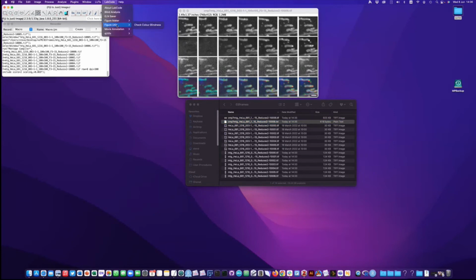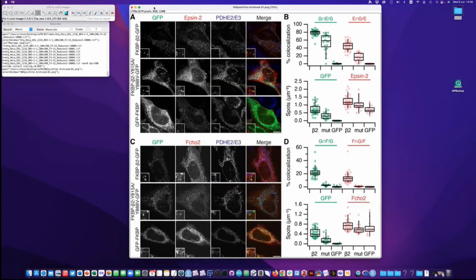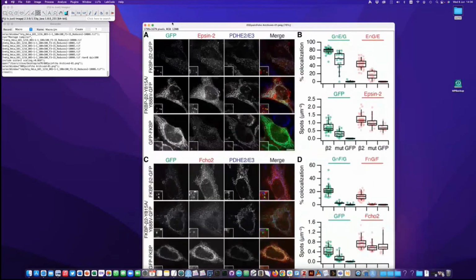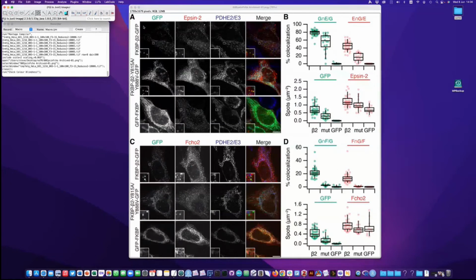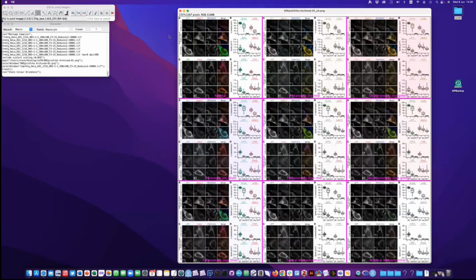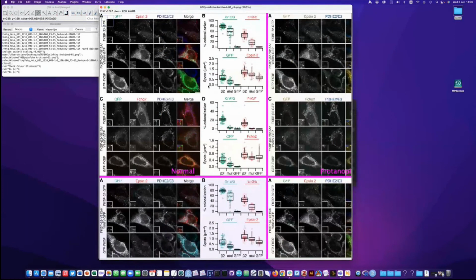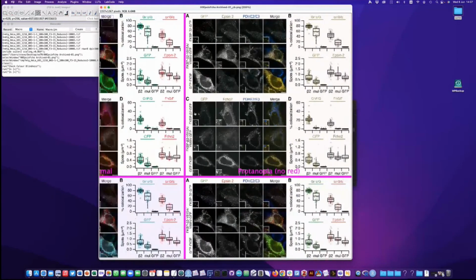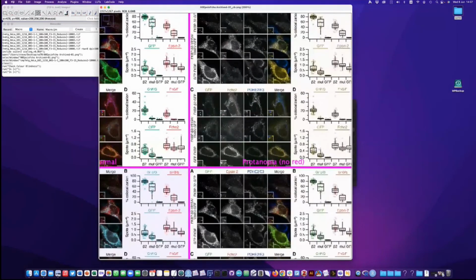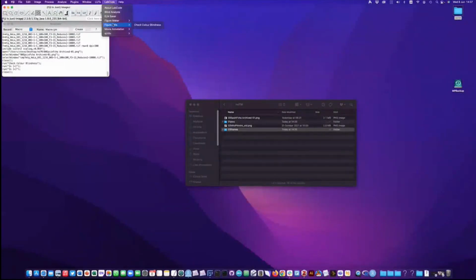Just to say that there's a few other goodies in here. I'll just very quickly show you. So this example here, we can check for color blindness. I'm sensitive about this because a reviewer recently asked us to check our images for color blindness. So this is just a way that you can have a look at the original images here, and this is what a colorblind person might see with your image. So you can check to see how accessible your images are with different types of color blindness using this little command here. So that was there.